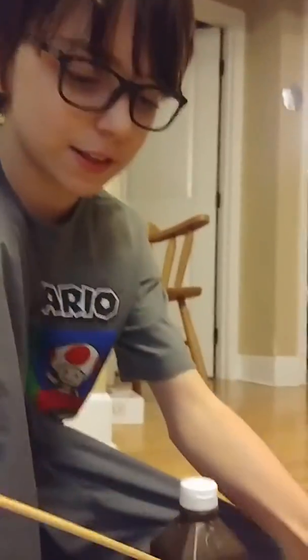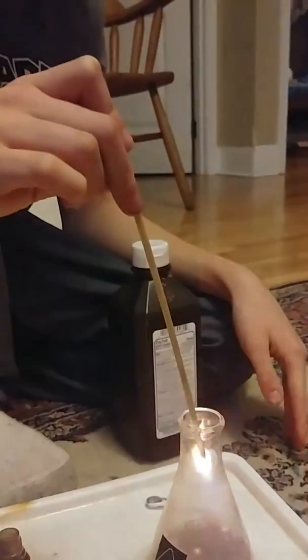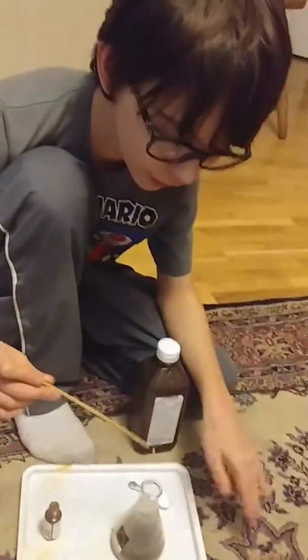This is me putting this splint into this flask of liquid. It ignited. And that's because there's lots of oxygen in the liquid.